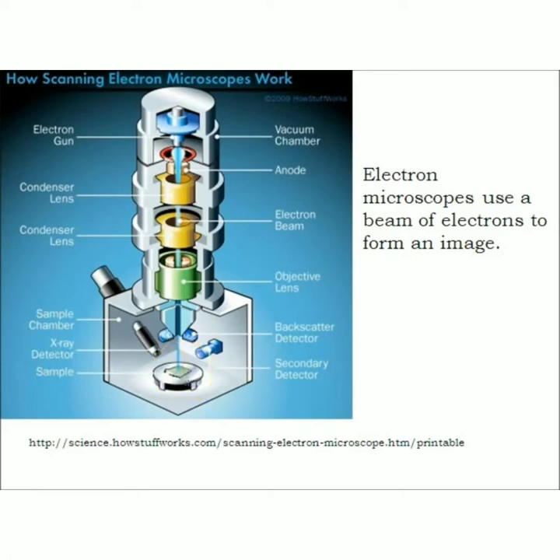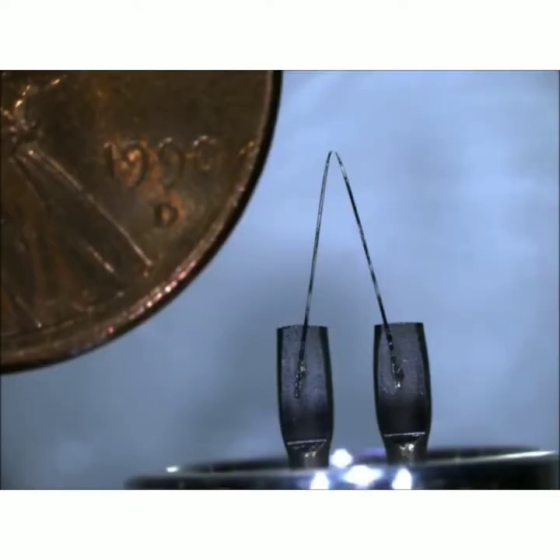So first of all, let's take a look at the electron gun. Here's a photograph taken with the Leica dissecting microscope. This is called a thermionic electron gun, which basically means we're going to heat it up, and it's going to give off a bunch of electrons. To give you some idea of the scale here, this is just a penny I had in my pocket. I stuck it down there with it so you could see what's going on.